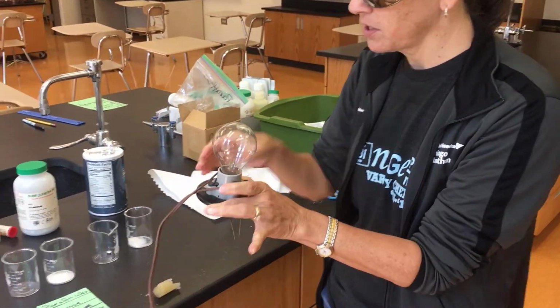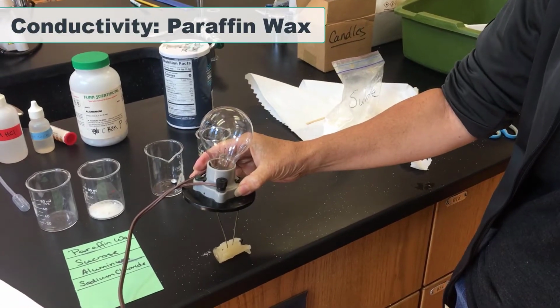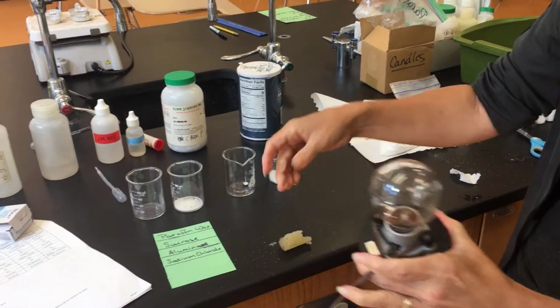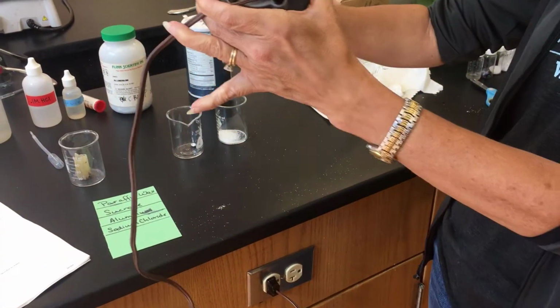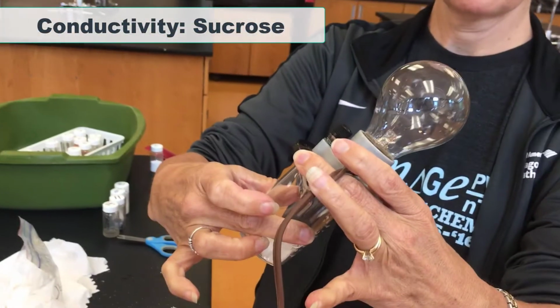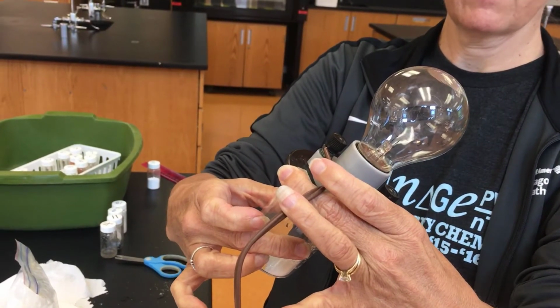I have a large chunk of it here, and nothing. Okay. Now my sucrose, I'm going to have to keep in the beaker, but I can insert the wires down in the beaker. And we are not getting any conductivity.